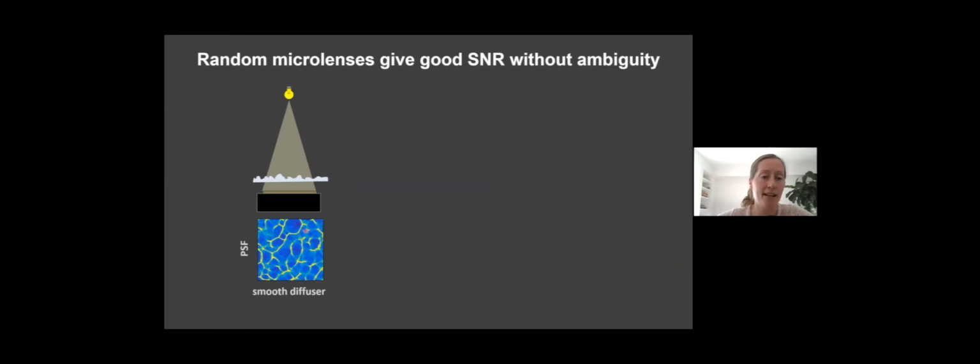And they have nice random focusing, which is good for the compressed sensing. So for compressed sensing, you want the light to spread out to lots of pixels. But for noise performance, you want the light to be concentrated in smaller areas. So this hazy stuff in between the focused areas is bad. This is just background. This is just making our SNR worse for this system.